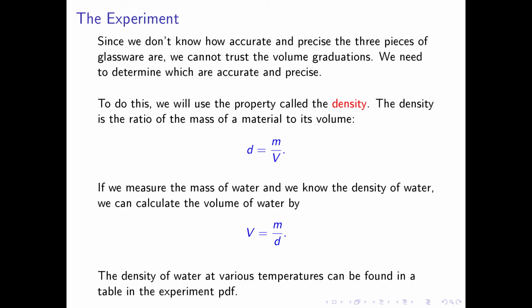The density of a material changes as the temperature changes. And so you will record the temperature of your water, and you will find the density of water at various temperatures in a table in the experiment PDF posted on Canvas.